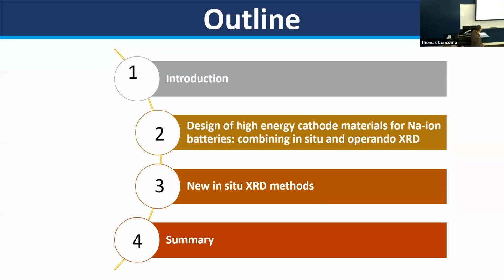All right, so I'm going to show two of our projects. One is the design of high energy cathode materials for sodium-ion batteries, where we combine in situ and operando XRD. And in the second project, I'm going to introduce our work building an in situ XRD for hydrothermal synthesis and a few other things.